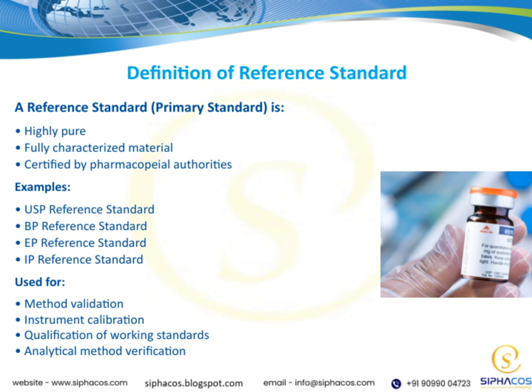Lastly, they support analytical method verification, confirming that our methods perform as expected. Overall, reference standards are the backbone of quality control in pharmaceuticals, ensuring our results are trustworthy and compliant with regulatory expectations.